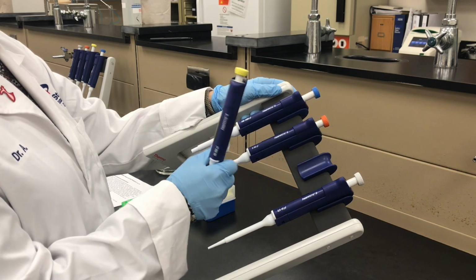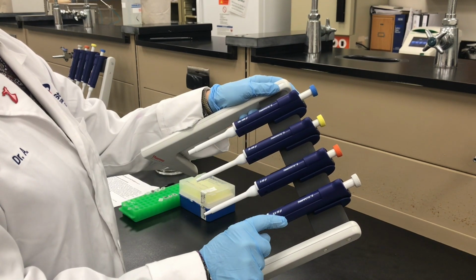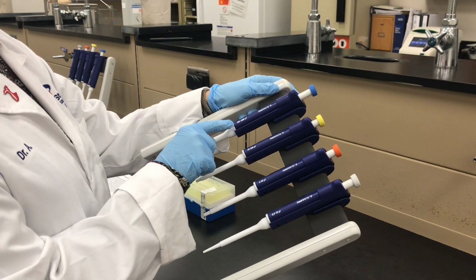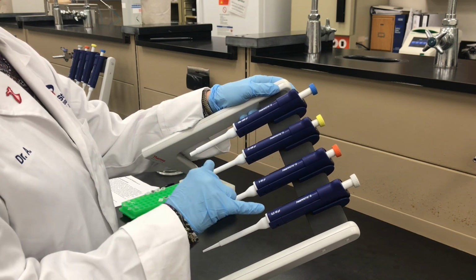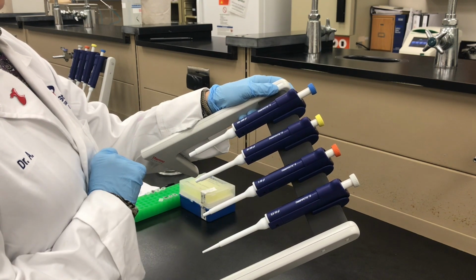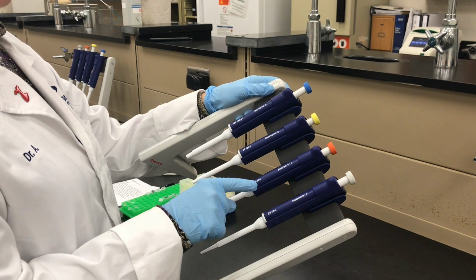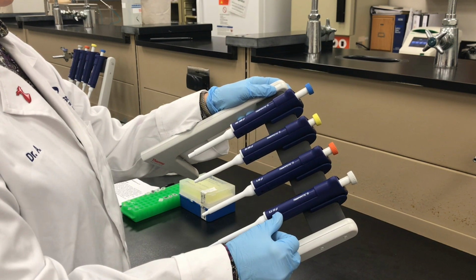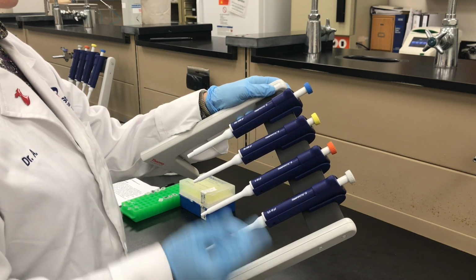Dang, they're not in the right order, but we'll fix it. It's all good. 0.5 to 10, 5 to 50, 20 to 200, and 100 to 1,000. So this is the range you should use. Don't try to use them for anything outside of that range. Number 1. Number 2, use the smallest range possible to be the most accurate. So if you're pipetting anything 10 or below, you want to use the gray top. It'll be the most precise.